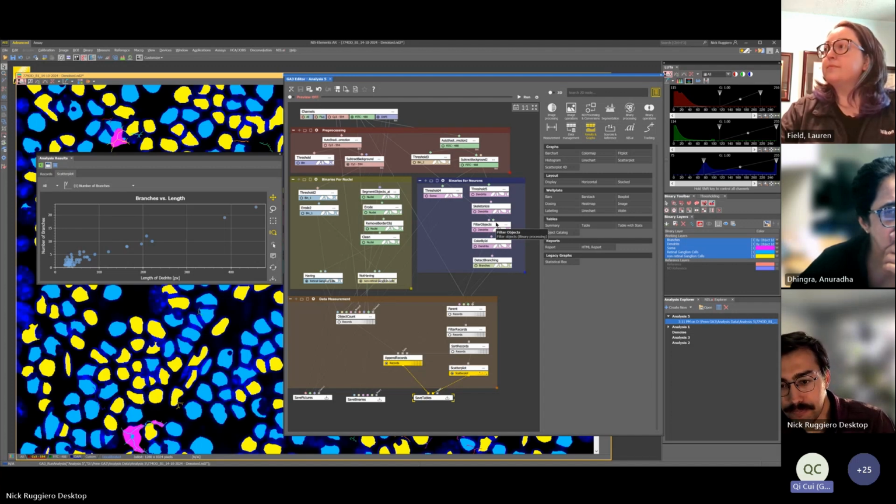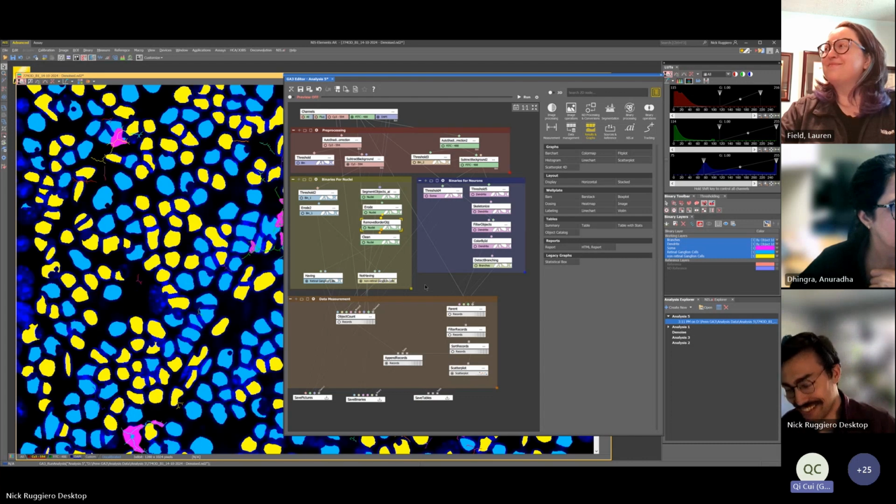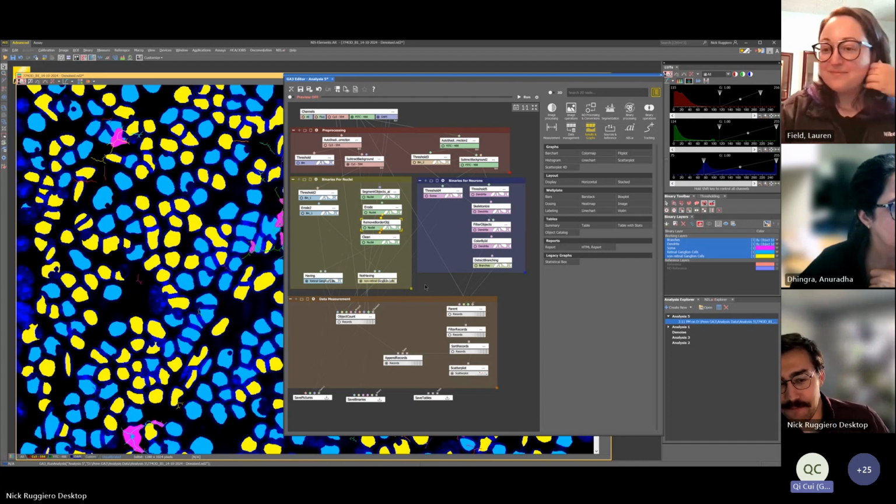Yeah, in particular, I think the RGC counts look great. Excellent. They're quite impressive, given how much background there is. I did ask Kale to share with you guys an image that has a decent amount of background to see whether that sort of gets in the way. So it's good to know that that doesn't seem to affect it all that much.